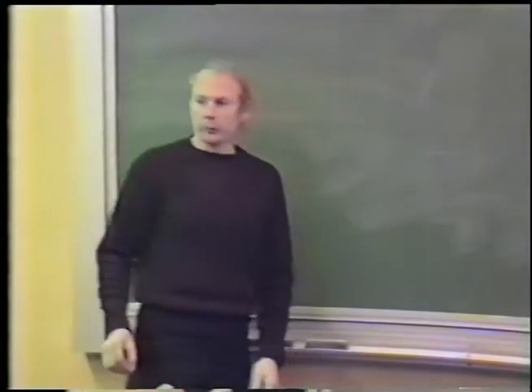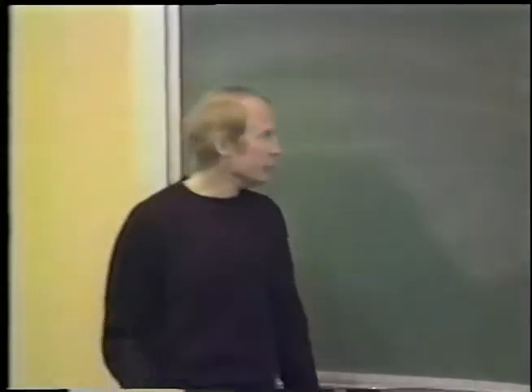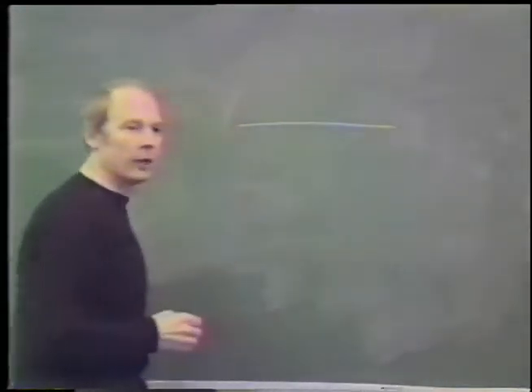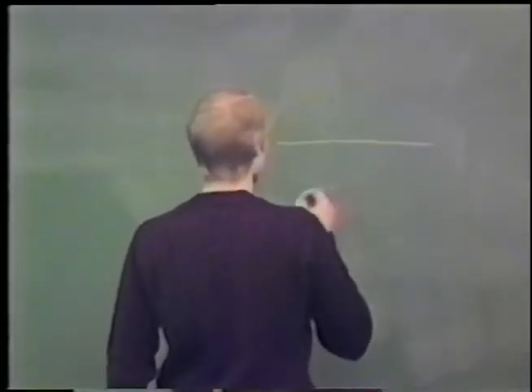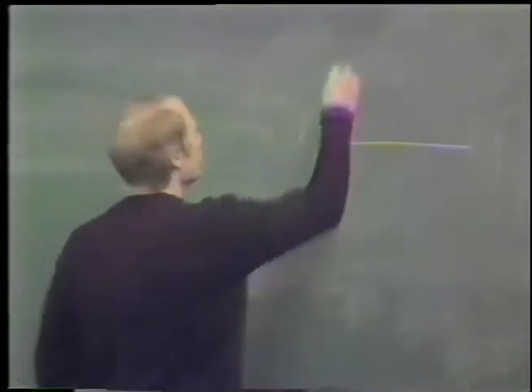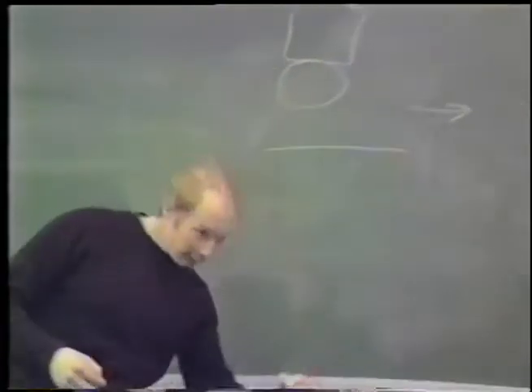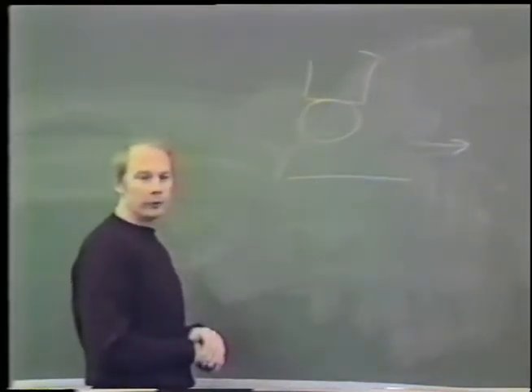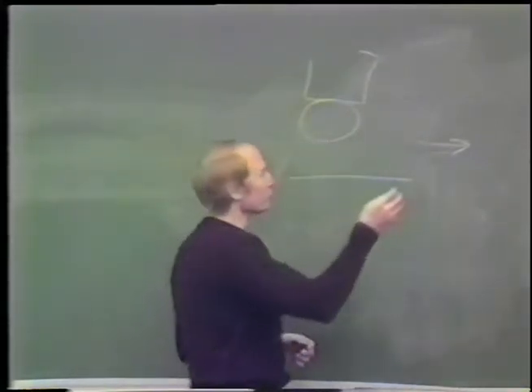To accomplish the rates of heat transfer that are required for ultra-rapid freezing, there have been two basic methods used. One is to rapidly bring the sample into contact with a cold metal block. In the early stages of development of this technique, you literally put the sample on the end of a stick, and by hand, you jammed the sample onto the cold metal block. This takes advantage of the very high thermal conductivity and heat capacity of metals.